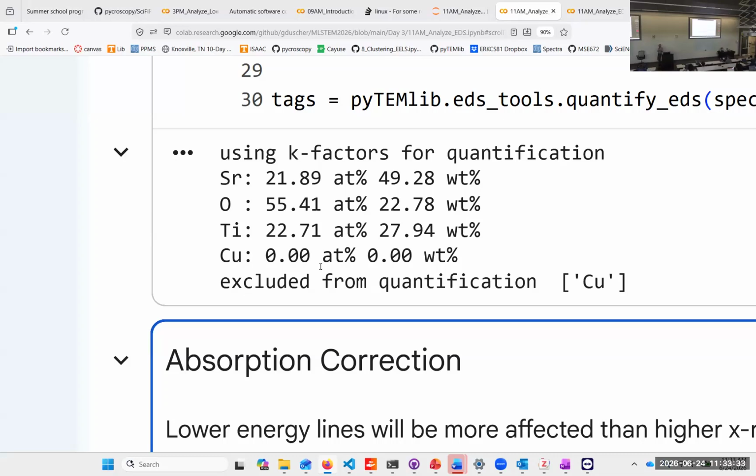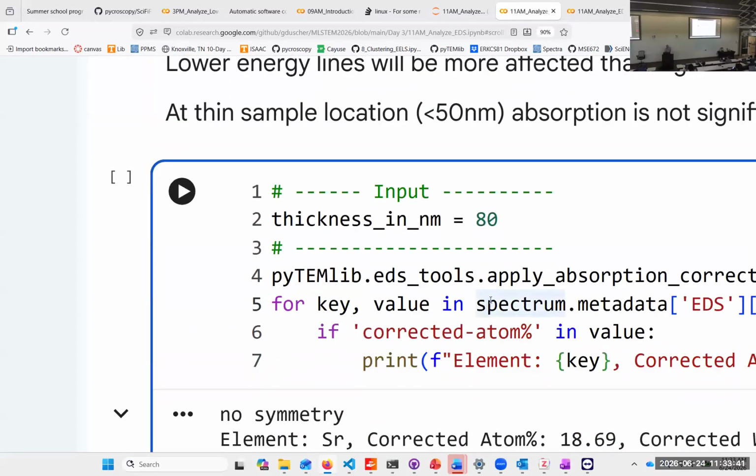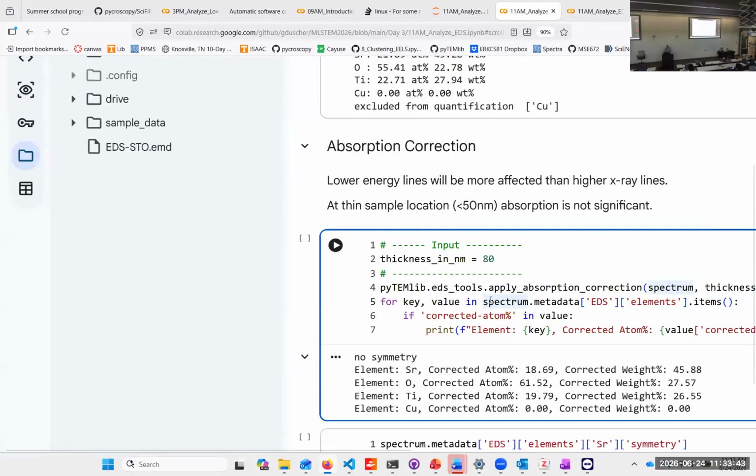And it will increase the small ones and decrease the higher ones in a relative sense. And let's be adventurous, right? It was not such a sick sample, but we could have used it.